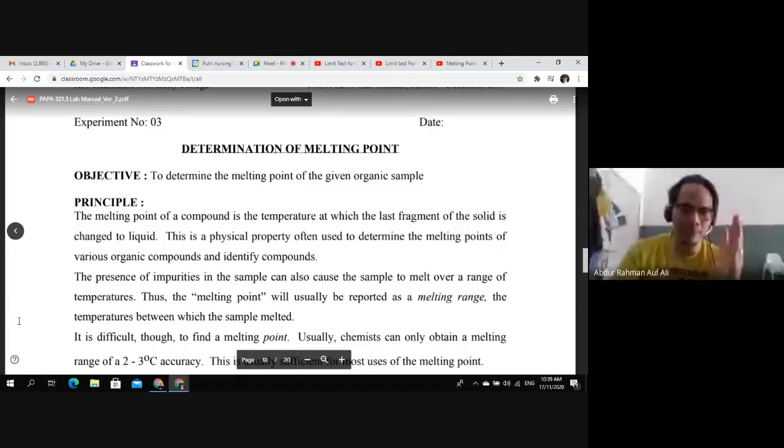Dekat raw material, dekat could be made in the production department. So to detect that error early on, before kita dah buat test everything, dah nak market dah jual dah, something is wrong. So we do this test, the first thing dulu. Okay, so we can receive that sample, that tablets from production department. One of the tests that we could do to identify the active ingredient, the API, adalah melting point.